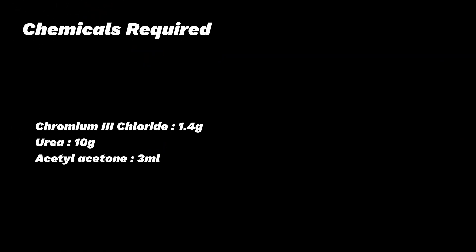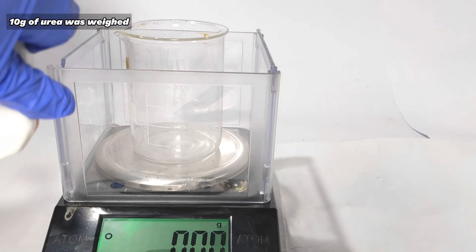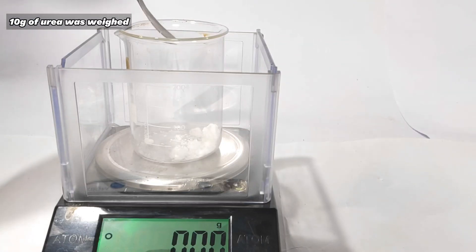For this experiment we will need 1.4 grams of chromium III chloride, 10 grams of urea, and 3 milliliters of acetylacetone. 10 grams of urea was weighed out in a 250 milliliter beaker. It was obtained from instant cold packs.